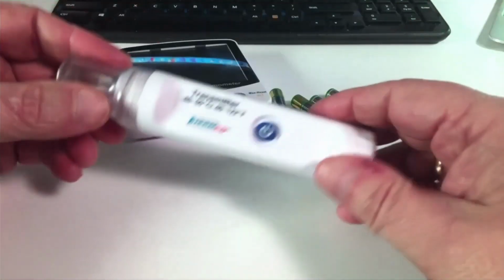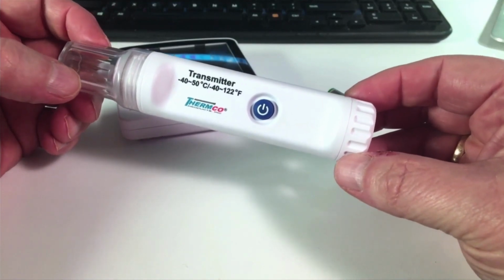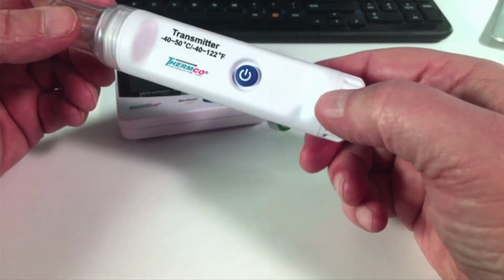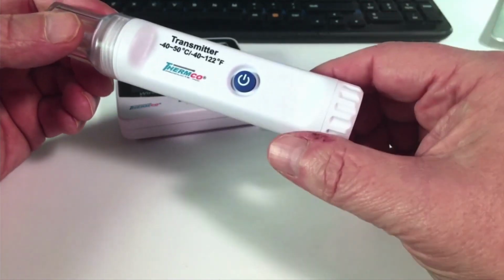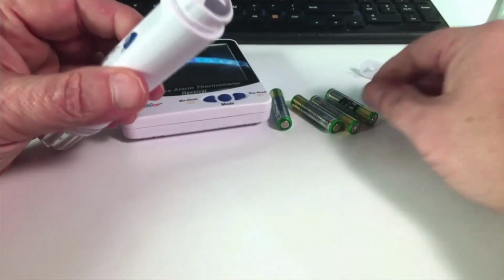Next we have the temperature probe. This is wireless. It is good for up to about 30 feet. And the thing to note is that this button is used to turn the unit on and off. But remember, when you put the batteries in initially, it's automatically on. You don't need to turn it on. All right, so let's put some batteries in and get going on this.